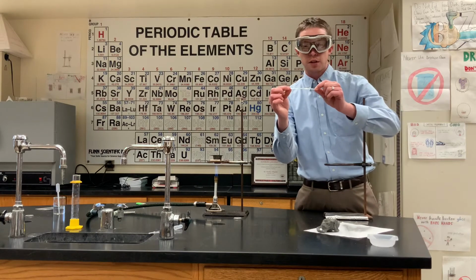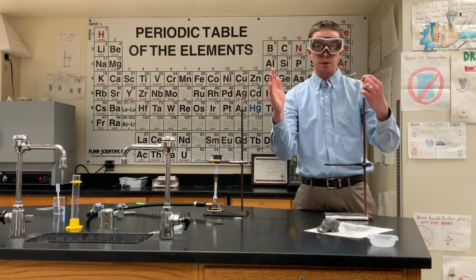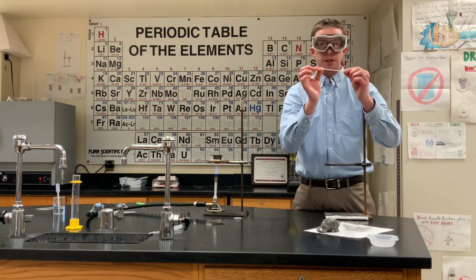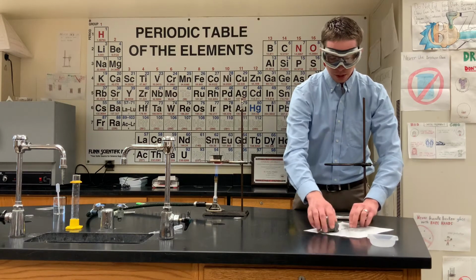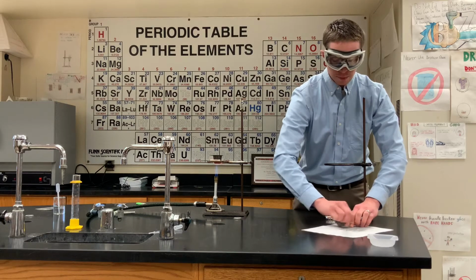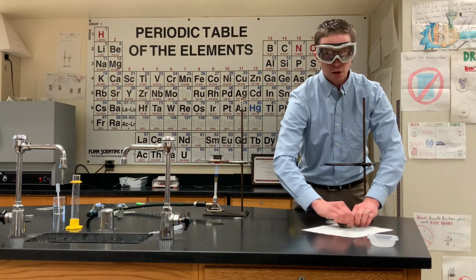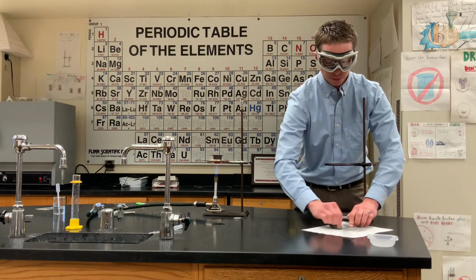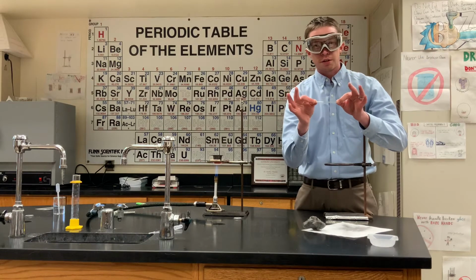So here we have a ribbon of magnesium. Technically, if you're doing the full thing, you're going to use about a 15 centimeter long piece of magnesium, but I'm using the small one for show. The magnesium ribbon has a lot of oxidation on it from the get-go. So the first thing we're doing is we're going to take off all that oxidation using steel wool until it is nice and shiny. Almost shiny, almost as shiny as aluminum foil. You're not going to quite be able to see yourself in it, but we're going to get it pretty close. So we've got a nice start to the shine on the ribbon here.